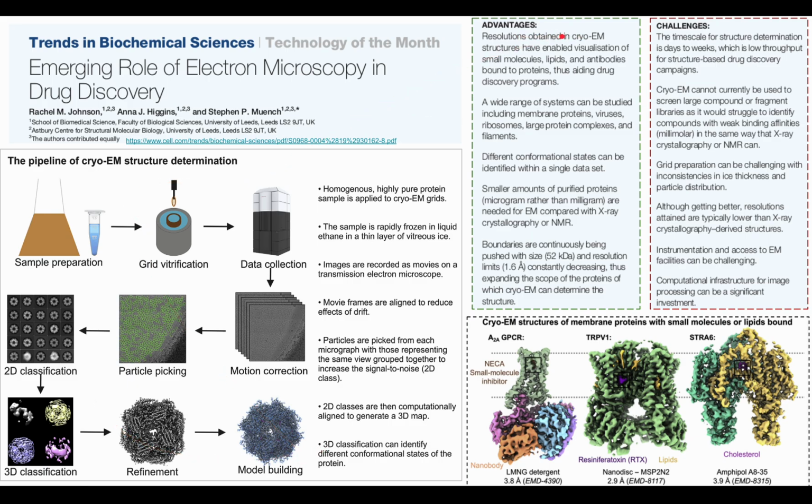Now there are certain advantages as well as challenges. The advantage is that the resolution which we obtain from these cryo-EM structures has enabled the visualization of small molecules, lipids and antibodies which are bound to proteins. So in this scenario we can perform drug discovery, because if we can design small molecules which might act as drugs, then we can see how these drugs interact with the proteins.